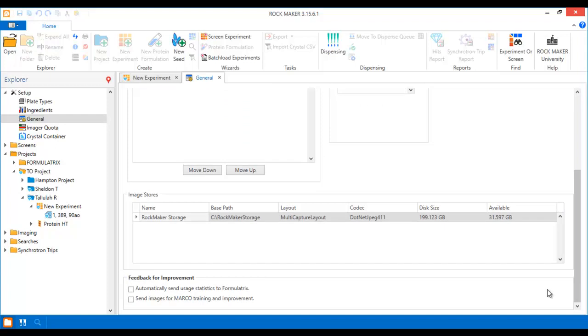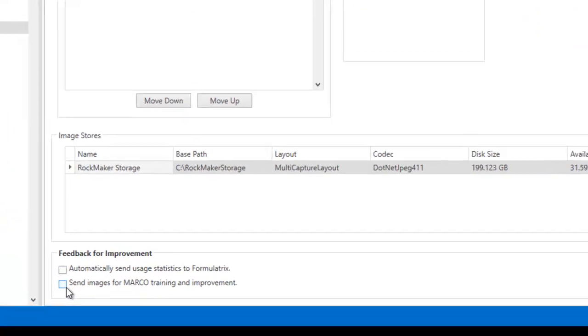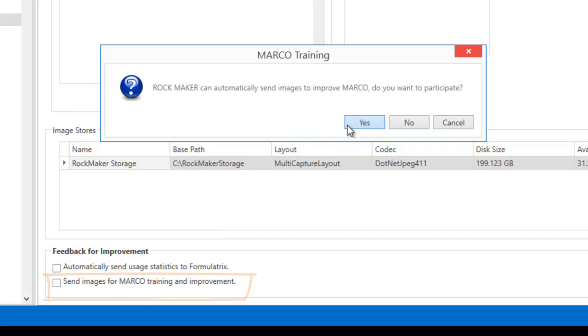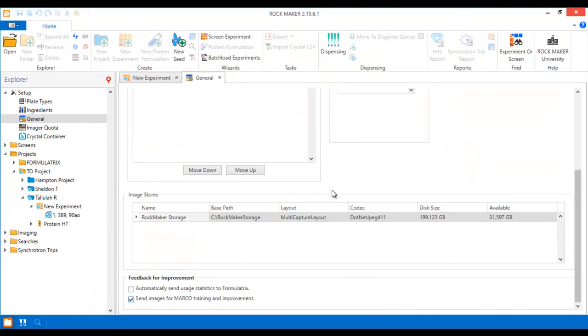With Marco available right out of the box in Rockmaker, scoring images is an absolute breeze. If you have any questions, please reach out.